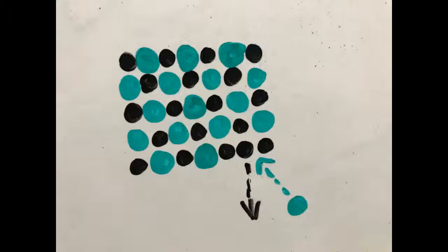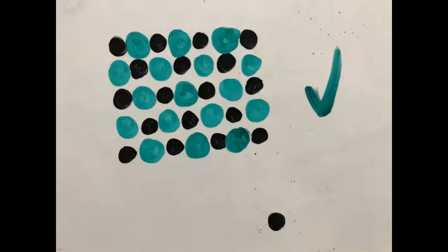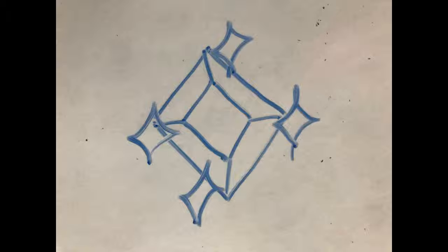If there are many contaminant particles in place in the structure of your crystal by the time all the solution has evaporated and the crystal formation process has stopped, the resulting crystal may not have a high level of clarity, because the contaminant particles affected the light diffraction throughout the crystal, as well as disturbing the links between the particles of the crystal, meaning your crystals may look like many smaller, non-transparent crystals rather than one larger crystal with a high level of clarity and quality.